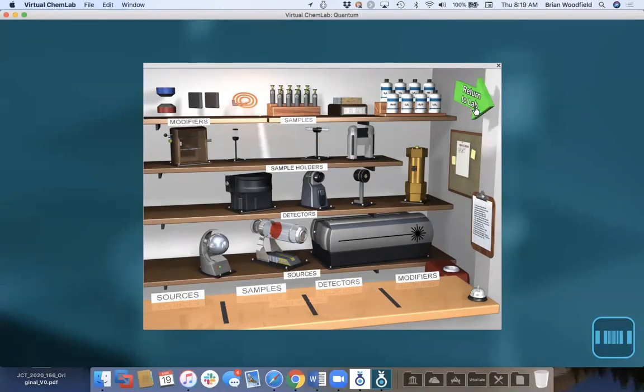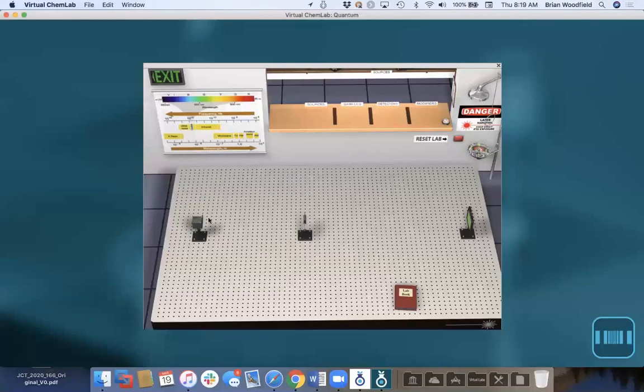So you can mix and match, and you have these modifiers. I'll show you kind of how they work. But you can mix and match and build it on this table and do experiments. And we have all the different permutations and all the different outcomes. And we encourage them to explore. It's really cool for them to find things that don't work, that blow things up or burn or catch on fire. And we have that.